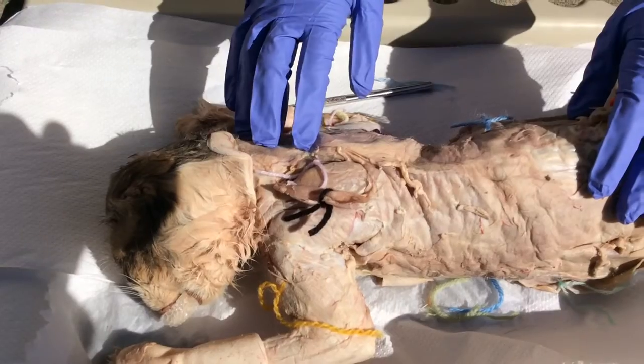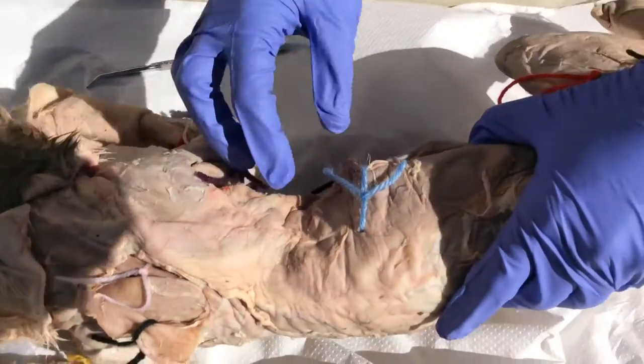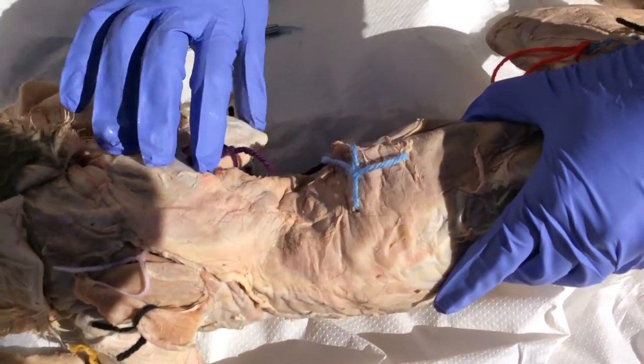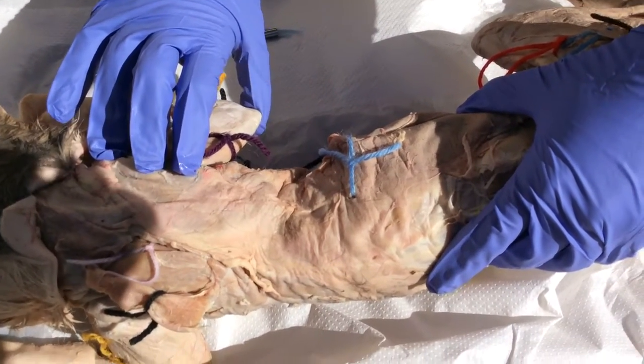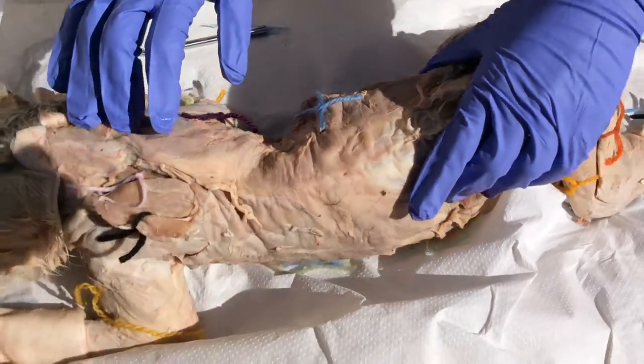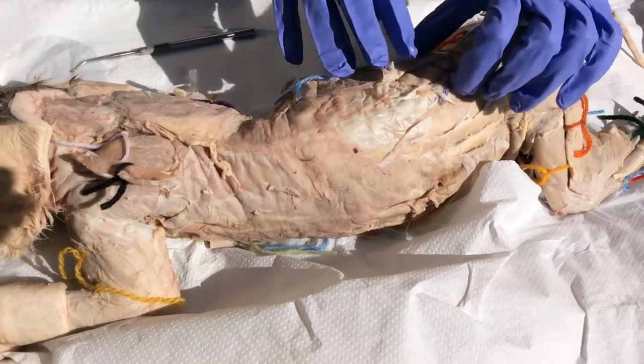The latissimus dorsi in aqua is the largest back muscle lateral to the spine. It adducts the shoulder, which means it's an antagonist to the deltoid.